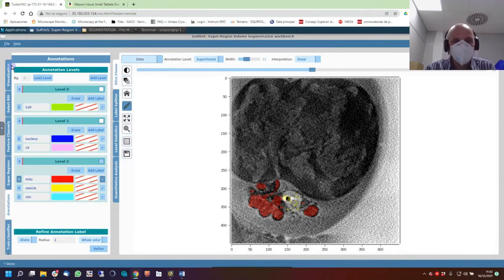So once we have all this structure, more complex, more simple, you need to know what's the label, what's the name. Level 1, the name of the two labels, level 2, and the name of the 3 ones in that case. And you need to know it. Why? Because for exportation, you will need it.